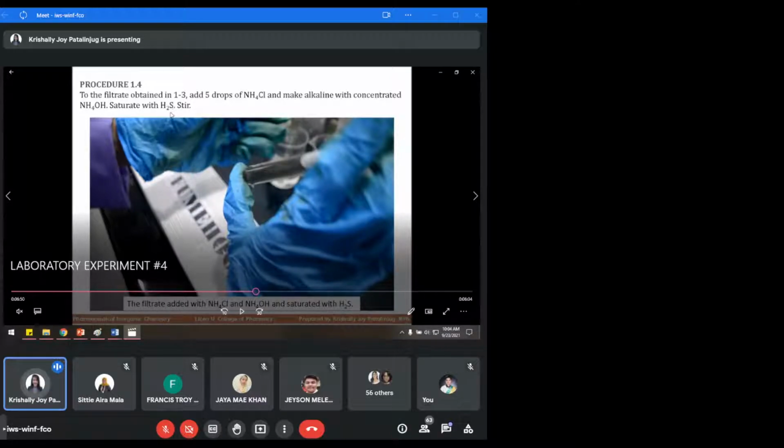And then it was saturated again, this time replaced with ammonium sulfide instead of hydrogen sulfide. The precipitate you get is the same, still in sulfide form. So take note, the precipitating agent here is ammonium sulfide, and the environment is basic, with ammonium hydroxide.